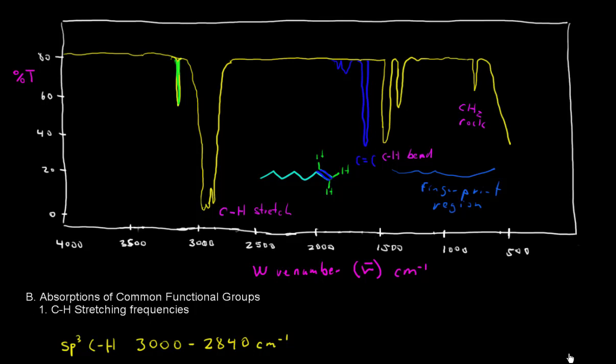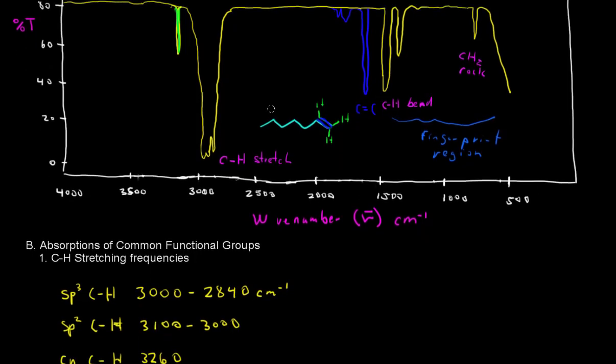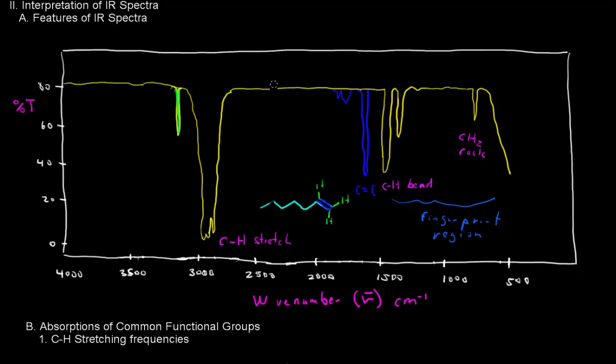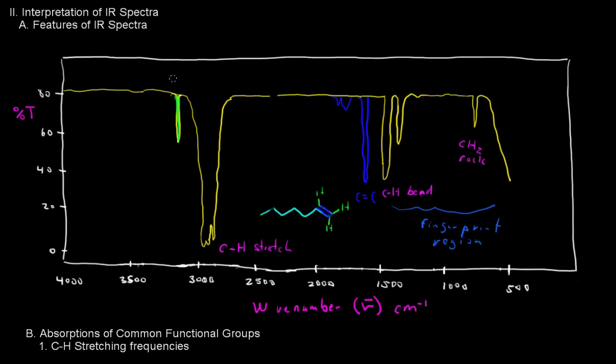Now if we look at 1-hexyne, again recall that we have an even higher frequency CH stretching.